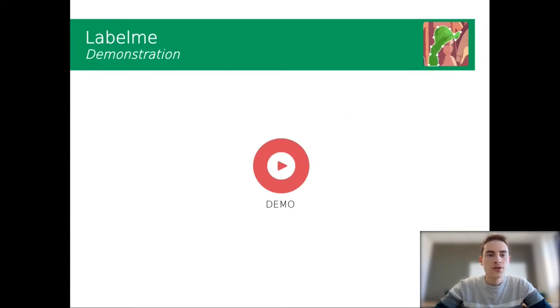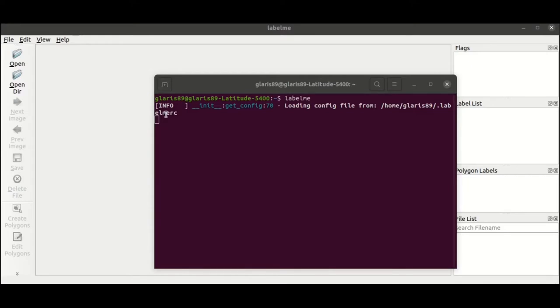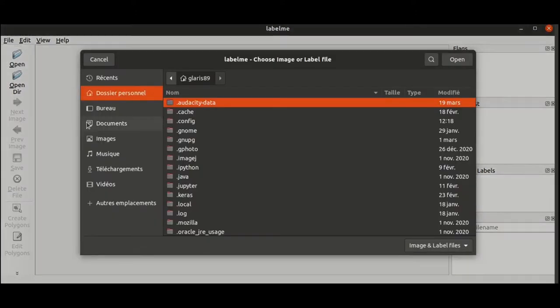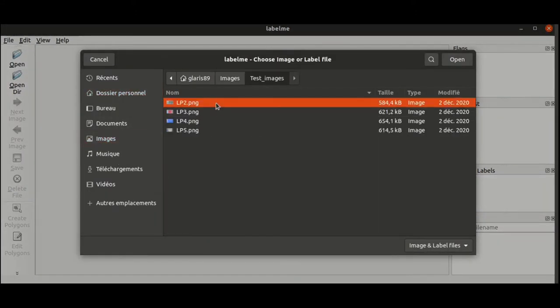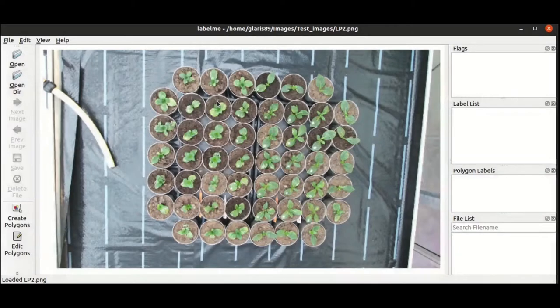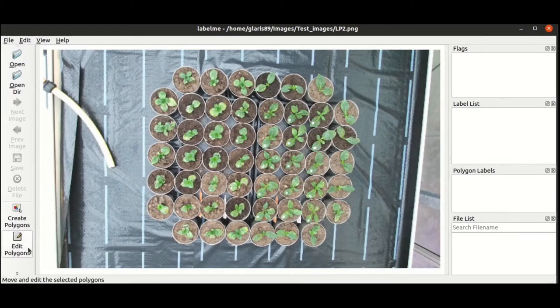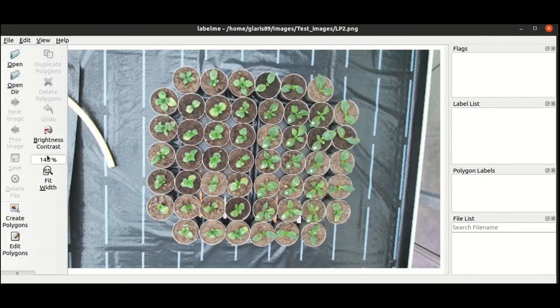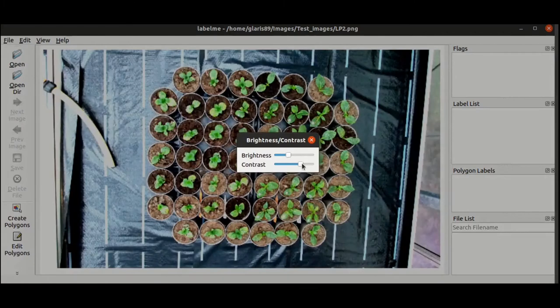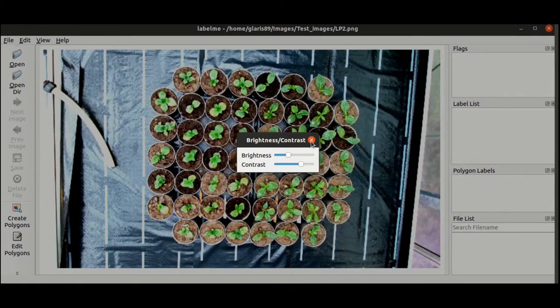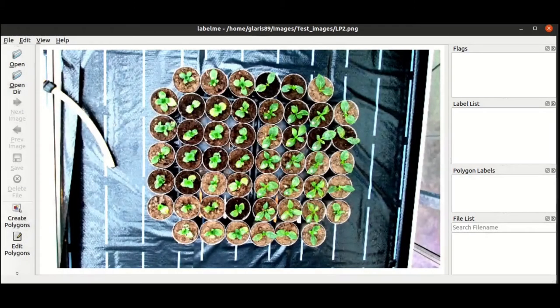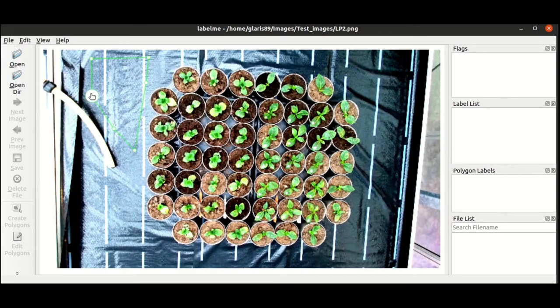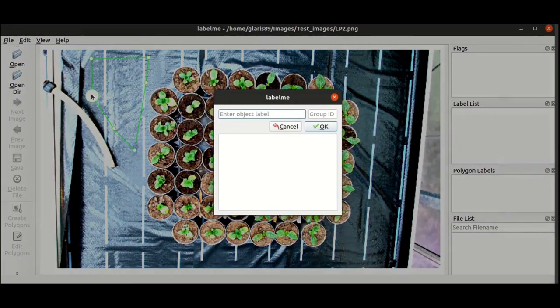I'm going to show you a little demonstration of Label.me. So let's go for the demo. You launch Label.me as a command in the shell. The first step is to open the image you want to annotate. Here we have some plants in top view. You can adjust brightness or contrast to better see the scene. Here we can just augment the contrast.